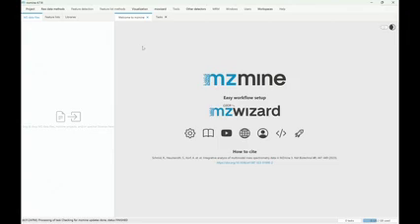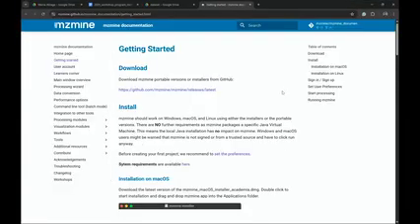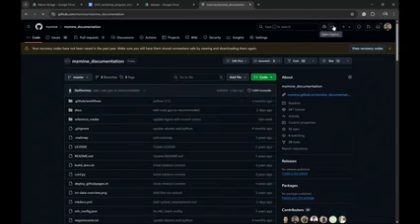If you open mzmine, there's usually the welcome page. With the welcome page, you have many buttons that you can click, and honestly, sometimes just do so. There's the YouTube, there's the documentation. The documentation also runs on GitHub. That's a platform that coders know and use, but honestly, it's actually for everyone. It's actually quite easy to get into.